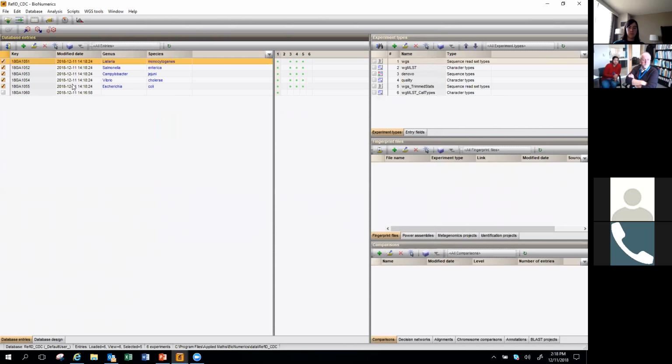And we can see now that for these 5 that were done earlier, I did get the de novo assembly and the ANI results, and I have a Listeria monocytogenes, I have a Salmonella enterica, a Campylobacter jejuni, a Vibrio cholera, and an Escherichia coli.